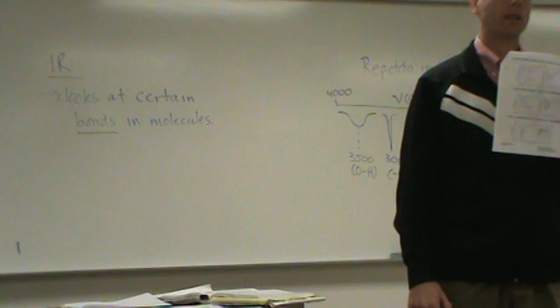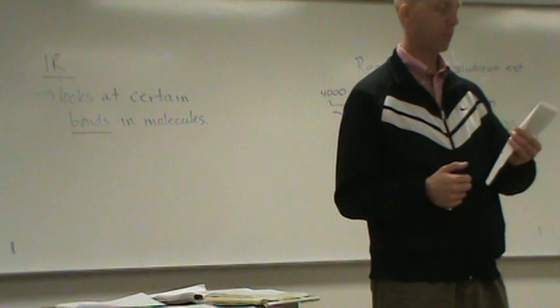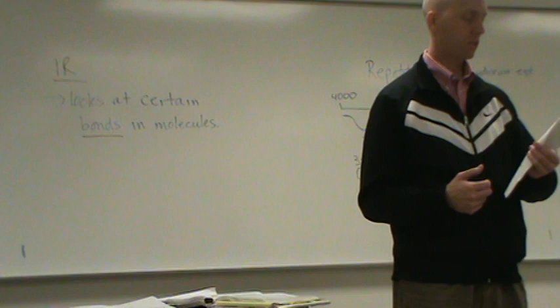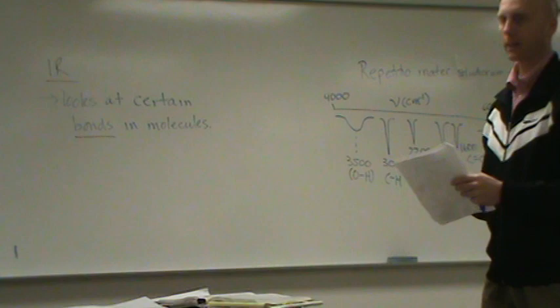Okay? Let's take a look at this one. Tell me which bands that we've learned are sticking out to you. Just give me the numbers. 1,600. Anything else? 3,000. 1,733. Yeah. Anything else? 3,000. Okay. So those are the main peaks that we've looked at from up here. I hope you're looking at the right page.